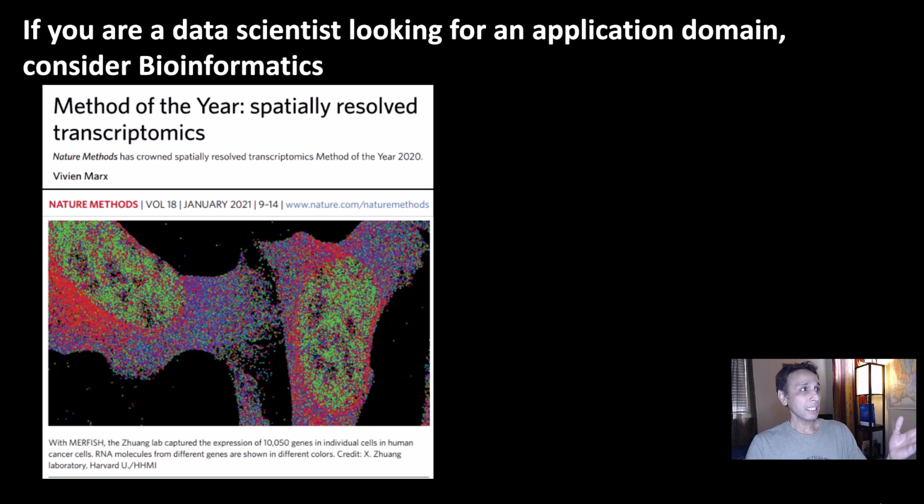Here you see I took an excerpt from Nature Methods, I guess. It says Method of the Year, Spatially Resolved Transcriptomics. This was from 2020 actually. I should have done my homework and been a bit more prepared. But again, this is a long video, so buckle your seatbelts.